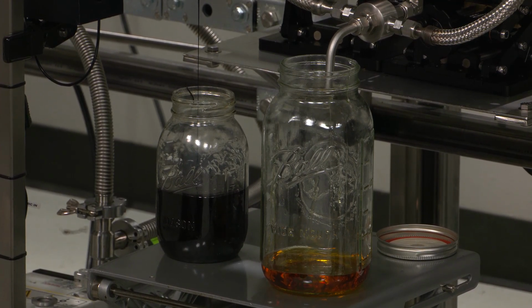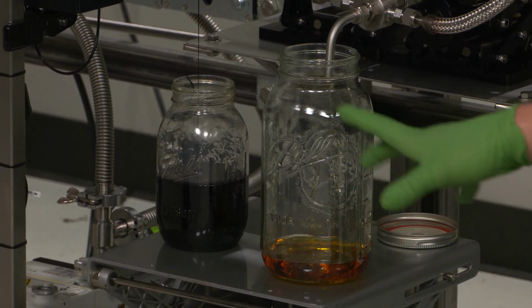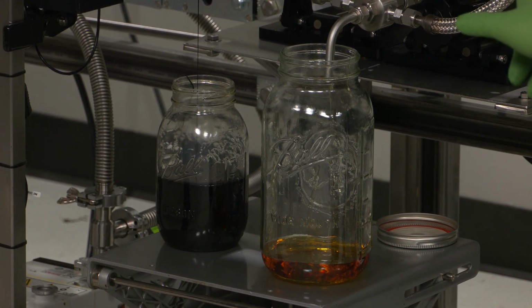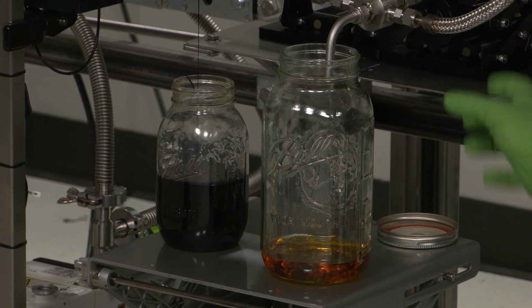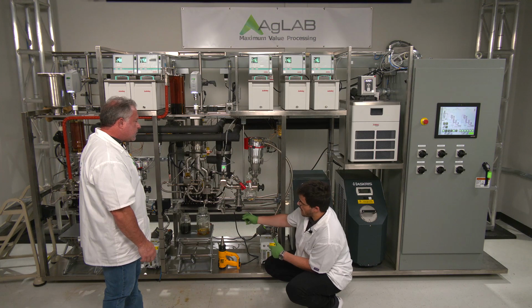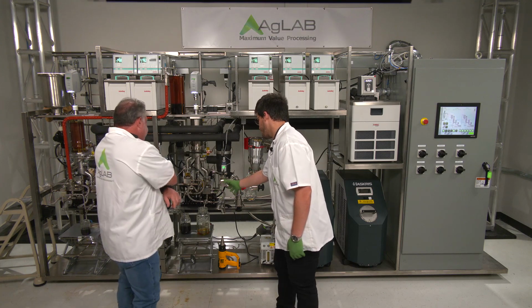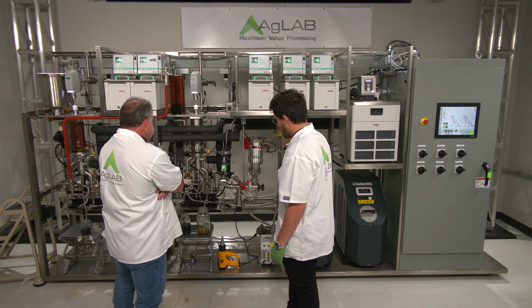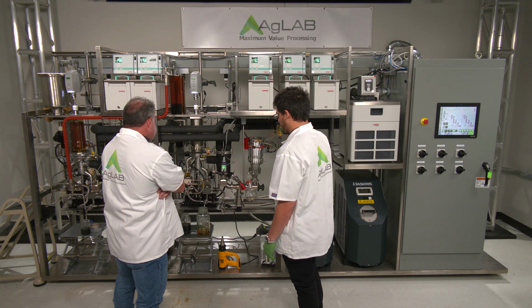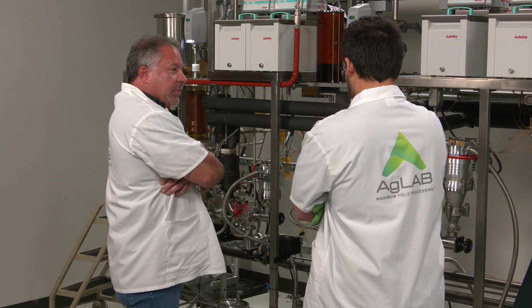This is just a side question. If we poured in our crude and ran the first stage with these parameters, and collected our heads and our distillate in this jar, would it be a very sloppy separation between the tails and the rest of the material? Because if you did this cut first and then came over here and did your terpene strip, I wonder if that would help a lot with the color. So you're saying do the polish before you do the terpene strip?